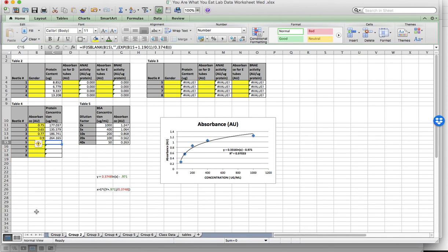So during lab 1 and 2 of the 3 lab sequence, we loaded 50 microliters of our sample. You can find this protocol on page 70 of your lab manual. So we used the micropipetter to transfer 50 microliters of the crude extract from tube 1C to either tube 1D or 1E. So because we don't know the concentrations, before we were loading just volume. So we might have been loading different amounts of protein into each tube based on the concentration of the protein.